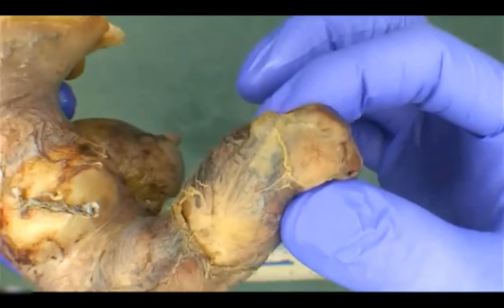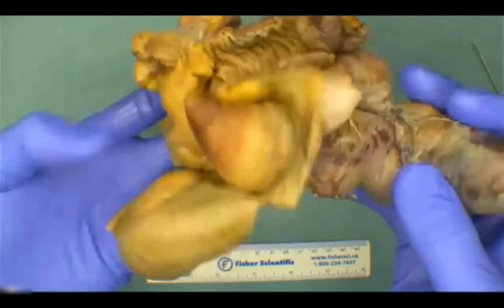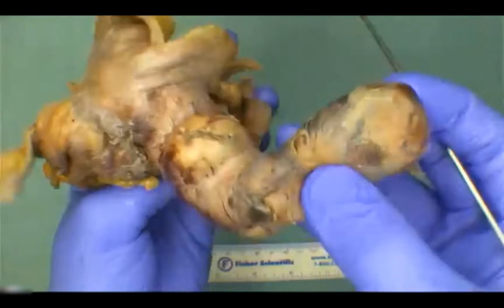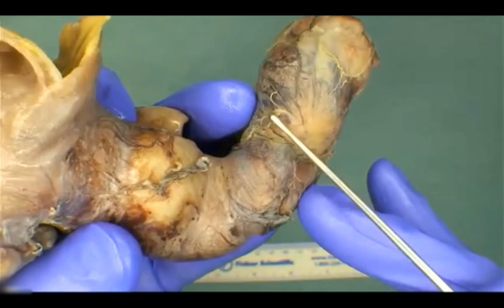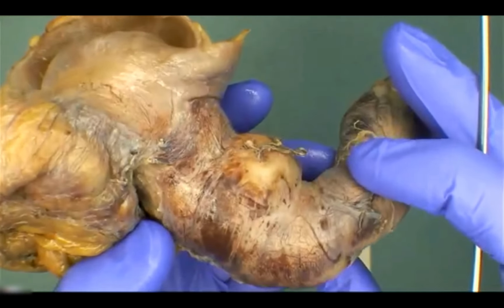So hopefully this answers your question. Does it bounce? No. Good. Okay, good, so yeah, we've got some fibrous adhesions. Good, like that, good observation. Oops, let me point some of those out. So see these wispy strands of tissue on the serosa? Yeah, those are all really good fibrous adhesions. Exactly, nice examples of adhesions.